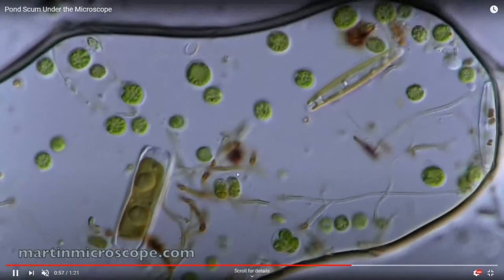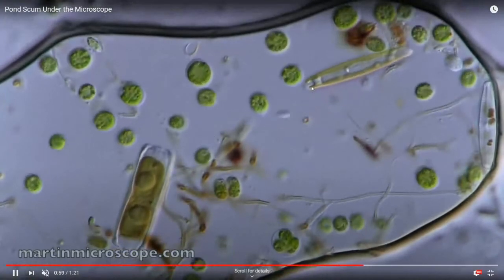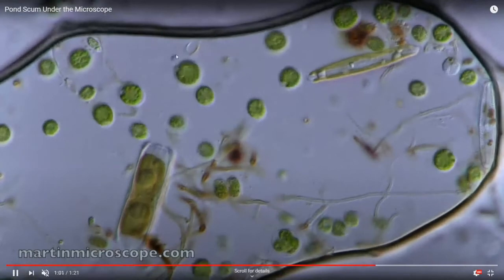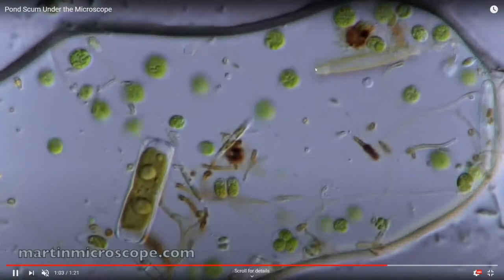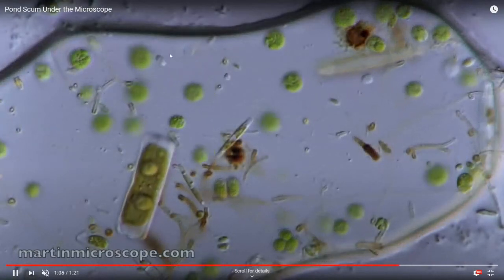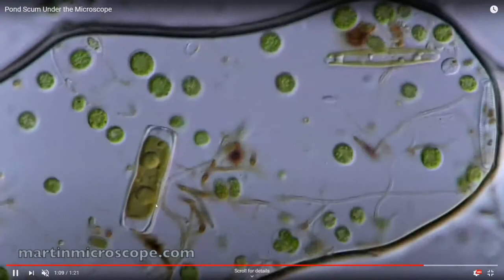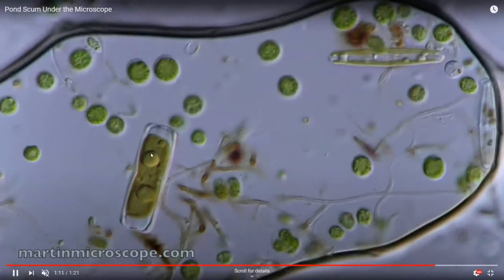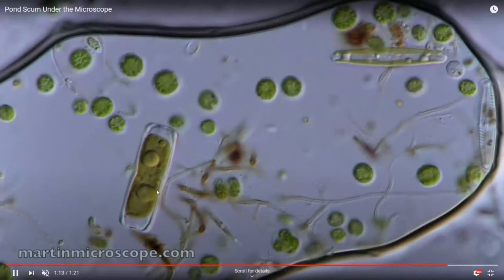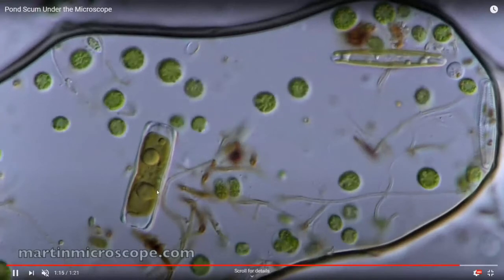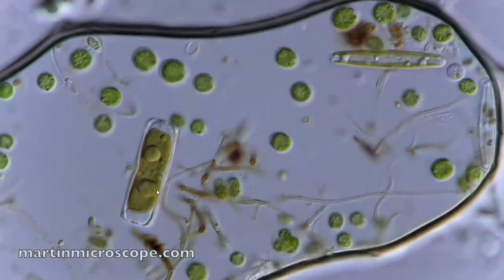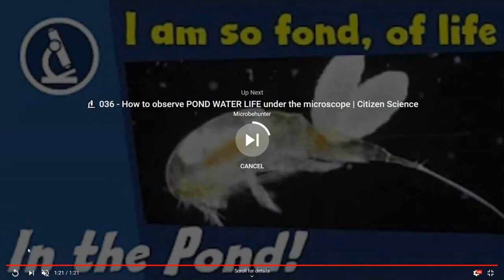You can see how they're vibrating around. You can see this cell here. There's another little guy swimming, but he's not green, so he's probably not photosynthetic. He's what we call a heterotroph — he doesn't have his own food. This big cell right here, look at those compartments. Based on that, can you guess what kind of cell that might be? Do you think it's prokaryote or eukaryote? So it was eukaryote, right?